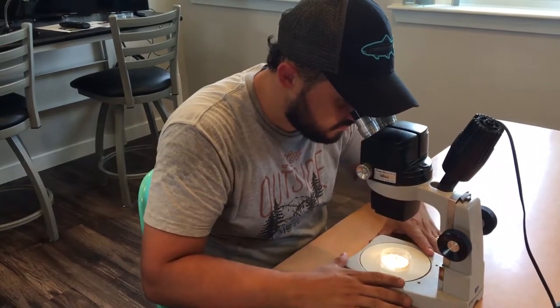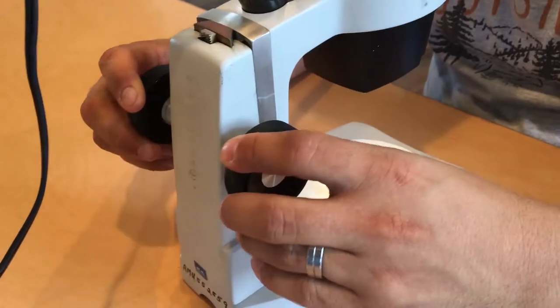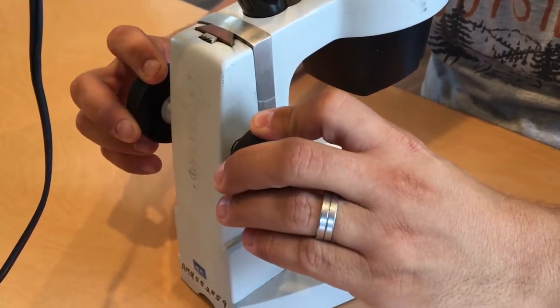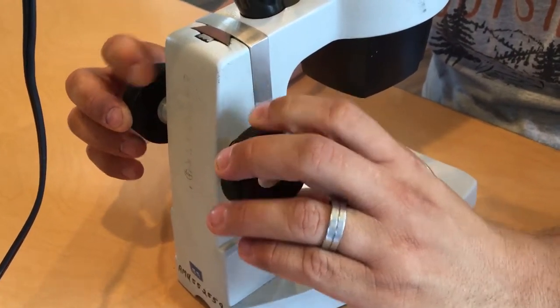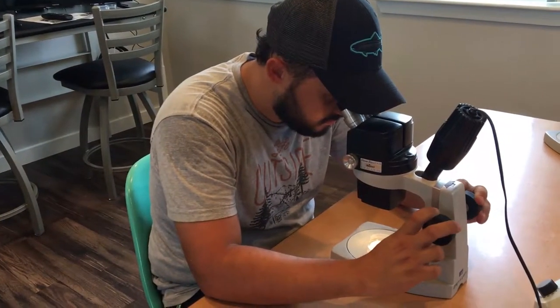Now notice the focus knobs. These are the larger set of knobs back on the microscope arm. Grasp these knobs and turn back and forth until you bring the object you have under your scope into focus. You'll be using the focus knobs a lot if you look at your subjects from different angles.